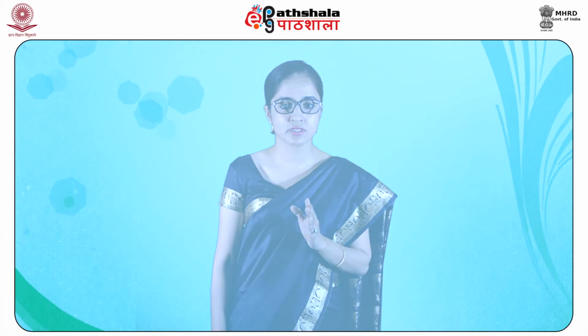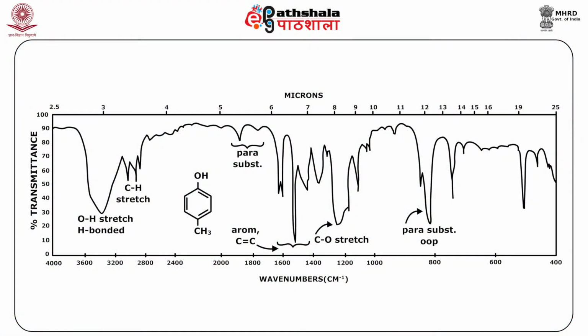Now, this can be clearly seen in the two figures where we have shown the infrared spectrum of hexanol and para-methyl phenol. Now, you can see and appreciate the values of stretching frequencies which we have mentioned, and in the next table, you can see the C-O stretching and the O-H stretching frequencies for phenol, tertiary, secondary and primary alcohols.